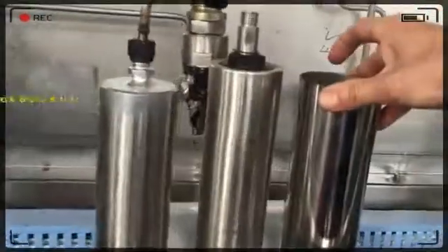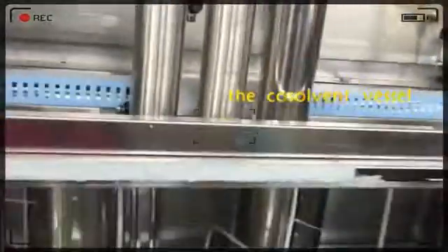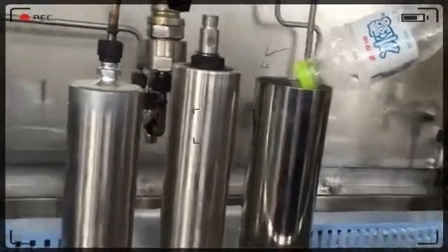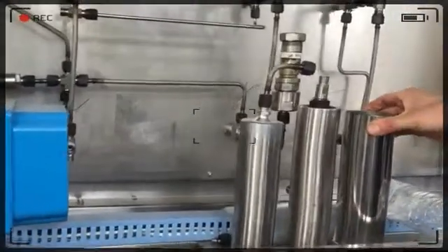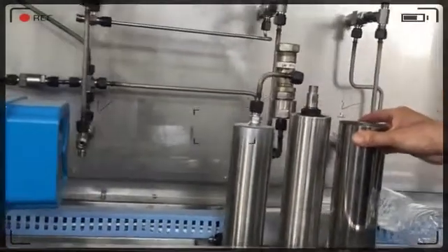This is not finished, so the fiber is not ready now. This one is for the co-solvent vessel. We will add some solvent into it, like alcohol. It is for some materials which need a co-solvent.